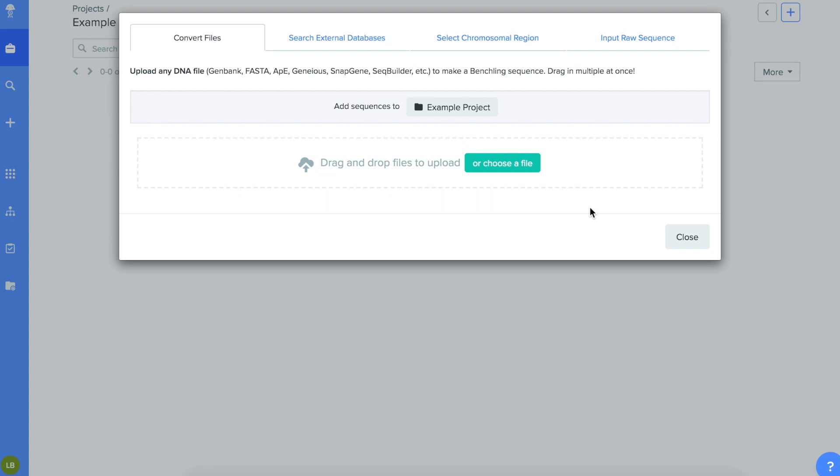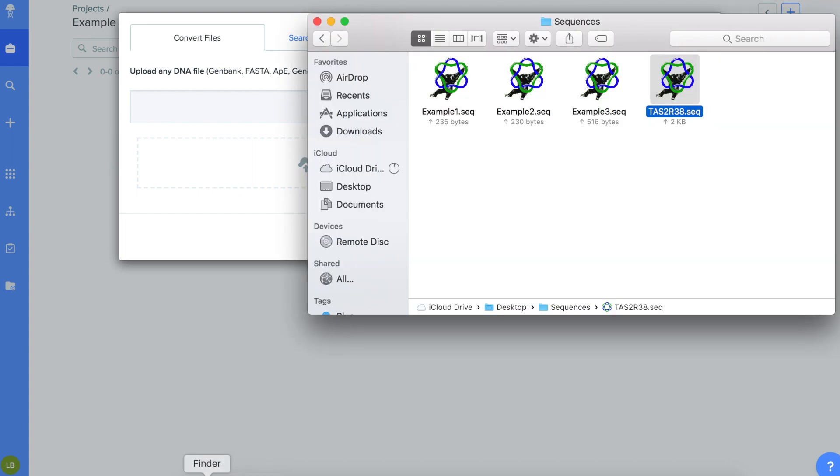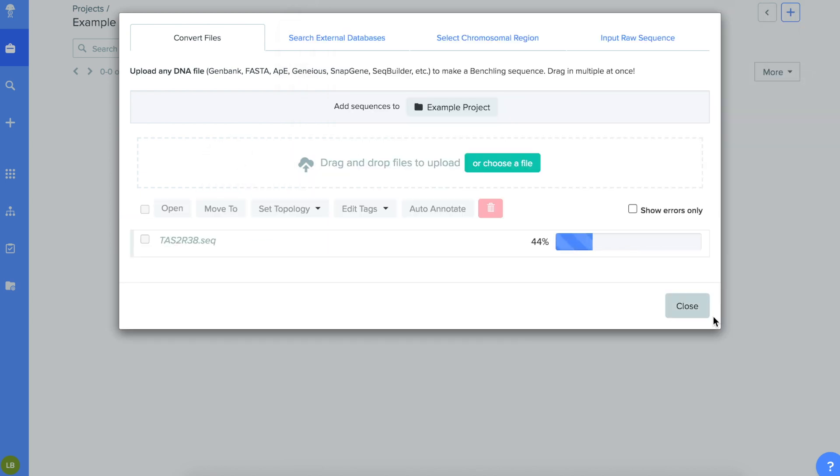Begin by uploading the TAS2R38 reference sequence. I put all of mine in a single folder so they'd be easier to find.